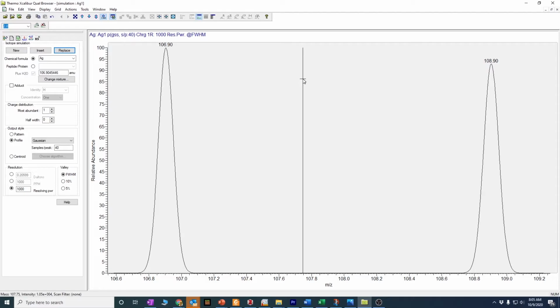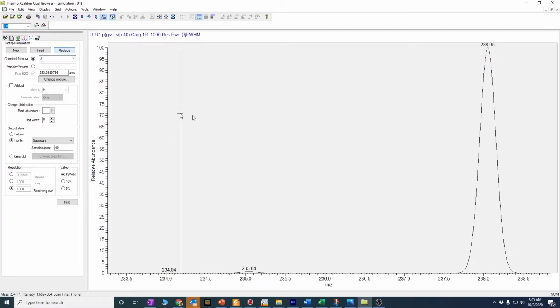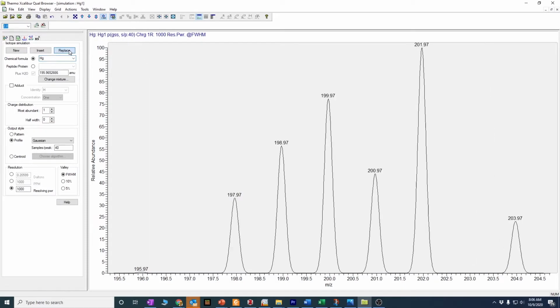And he actually discovered isotopes because of the mass spectrometer. And then pretty quickly went on to help out with the Manhattan Project to develop the nuclear bomb in World War II, looking at uranium ratios. So if we look at uranium, we see that there's uranium-235 and 238, but uranium's not so bad. So all these metals are, mercury is wild.